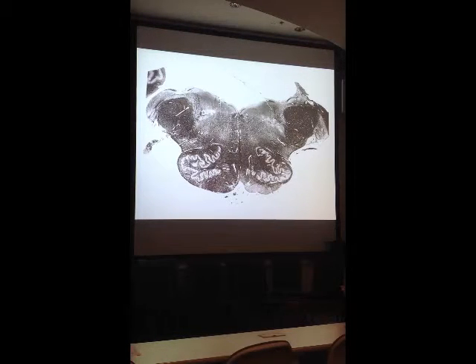Now again, in the medulla, it's important for you to know that there's a major ascending somatosensory pathway that occupies this white matter strip on the midline. What ascending somatosensory pathway dominates this area through here? It's the medial lemniscus. Those are fibers carrying, as you know, information of fine touch, vibration, and proprioception from the contralateral side of the body.